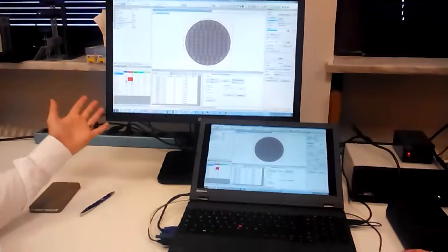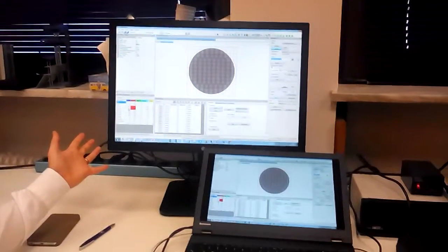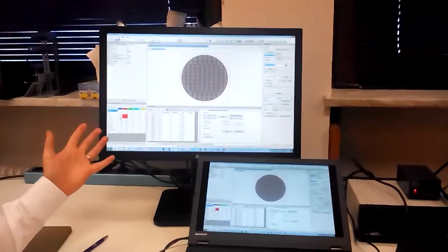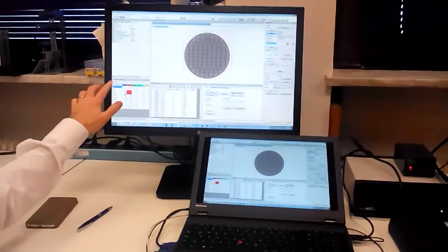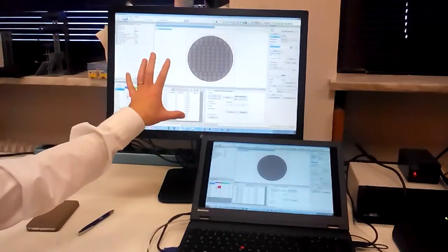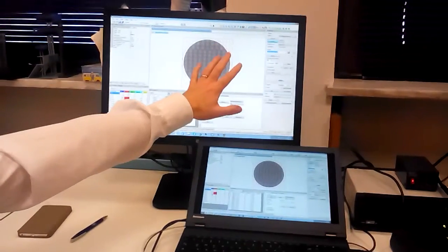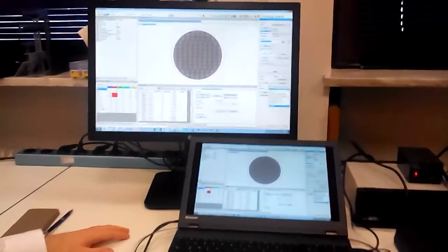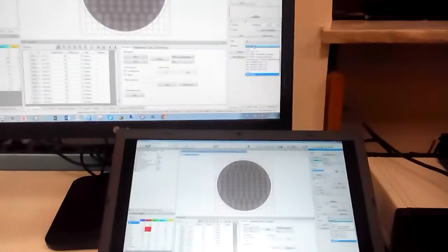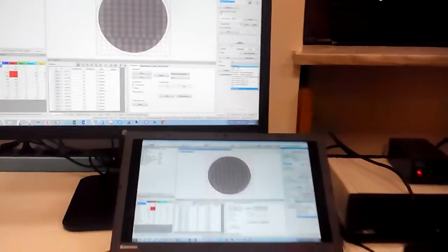So it's a very, very good, very quick way of seeing that you have a failure instantly. It does all of the analysis by itself, completely independently, based on these embedded reports. And the VDA BD19, as I mentioned, is standard. It's already fitted in here, so all you have to do is just select it as an option directly. You can change this here at any time, before the measurement, after the measurement, it doesn't matter.